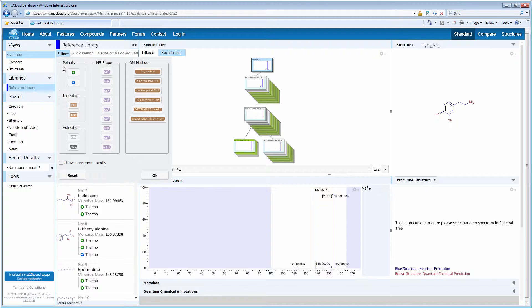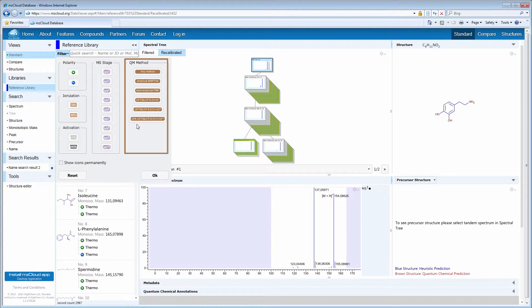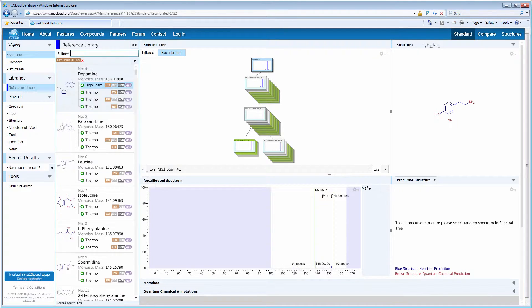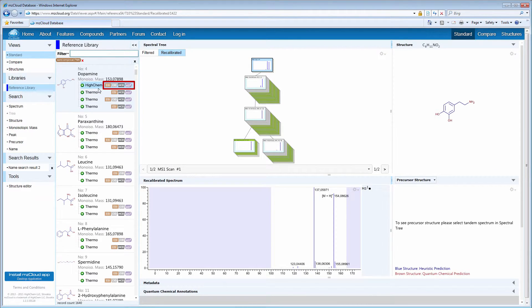Another way of retrieving records is by using a filter. You can filter by polarity, ionization method, ion activation, tandem stage, and the QM method. The filtered records appear in the Search Results pane, and the icon indicates acquisition methods and spectra types that the spectral tree consists of.